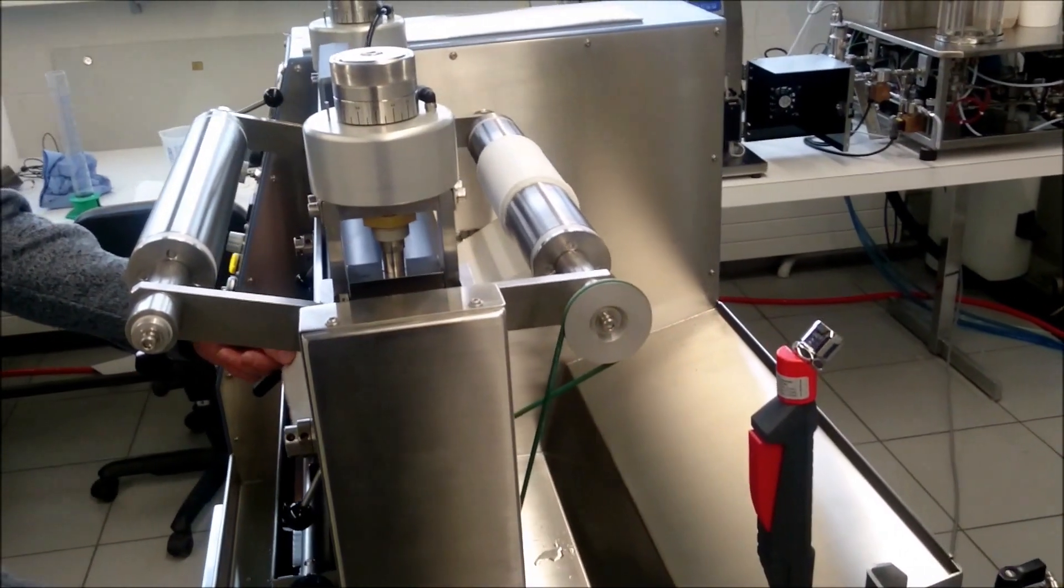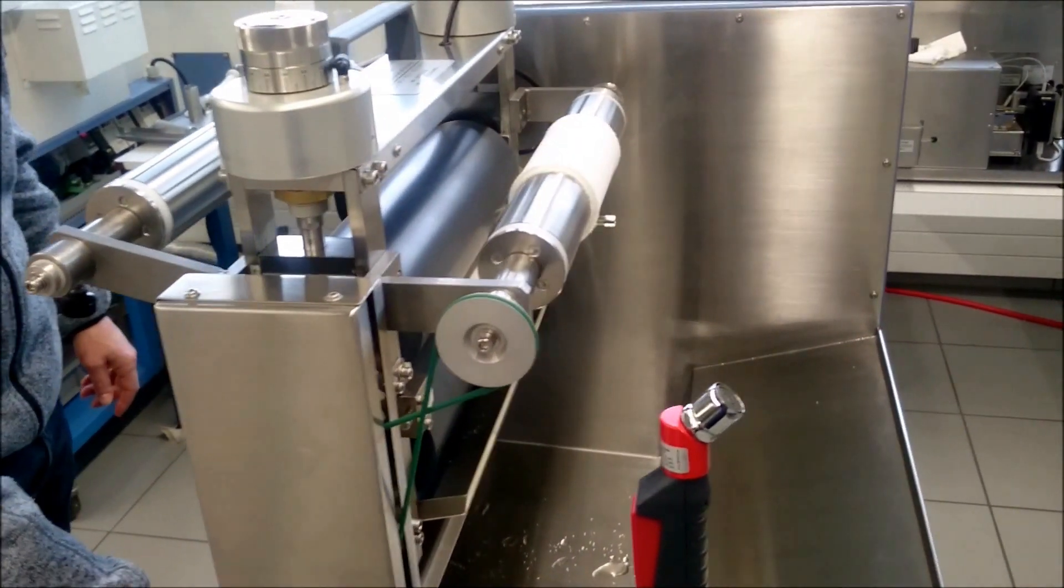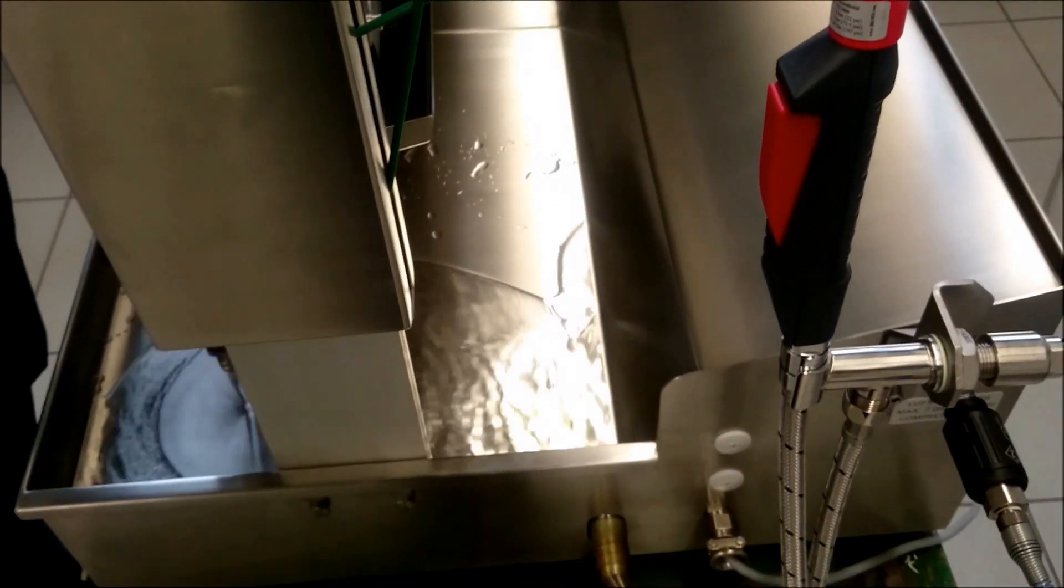The sample is finished. I open the outlet. And I can start again with another sample.